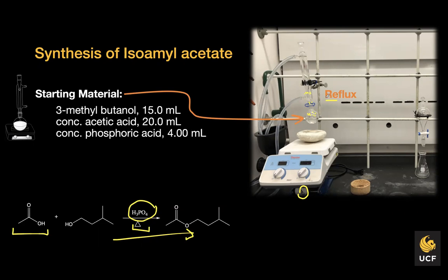Once you see that, then you start the time of reflux, and that's when we started heating up the reaction for 25 minutes. So it could take 10-15 minutes until you see that condensation ring, and then you start heating up the reaction. Now, the time it takes to reflux a reaction mixture really depends on what we are starting off with, right? And how far that condensation ring reaches also depends on the reaction. But for our purpose, that's where it was.